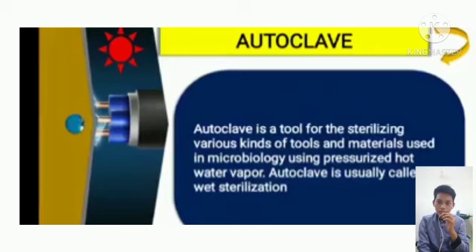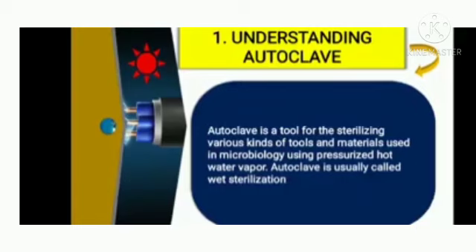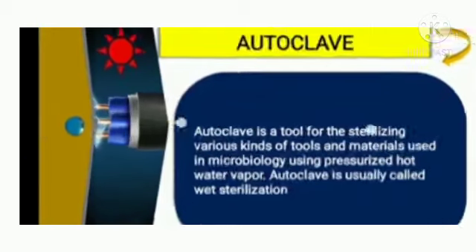The sterilization process itself has many types, such as filtration, heating, sound energy, and radiation. The sterilization process using an autoclave can be said to be one of the best because it uses a heating process with a temperature that is made periodically in a certain time unit.